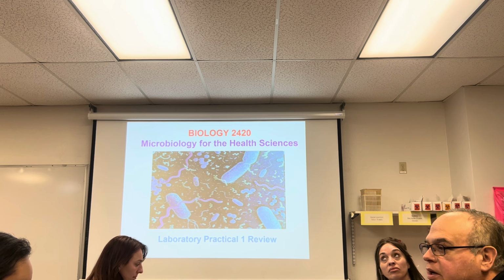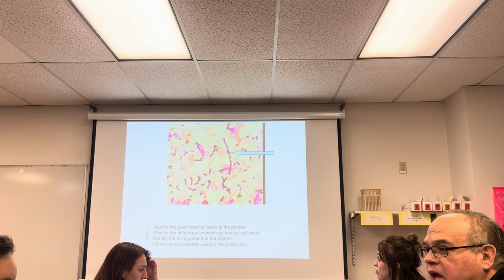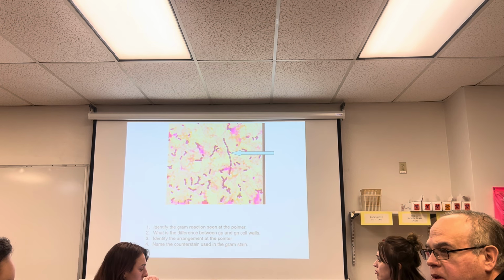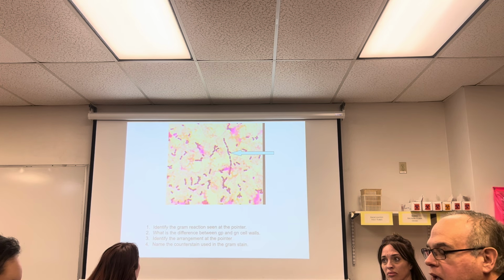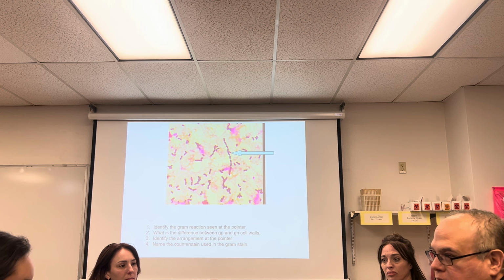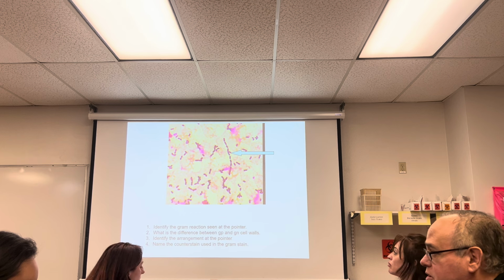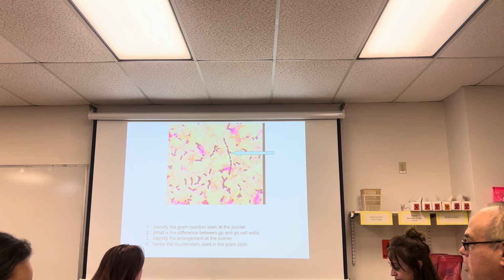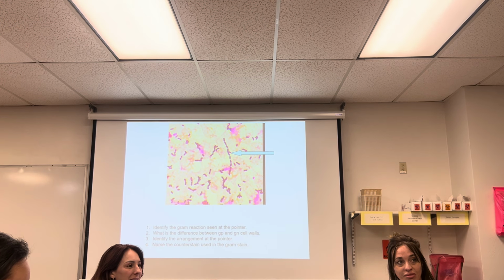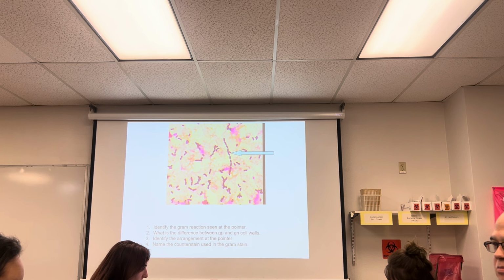So, when we look at a slide, because there's questions on here, your exam will not have questions on them. I'm just going to pop up an image and ask you what comes to my mind. That way, no practical is the same. Okay? So the first thing I want you to consider is, if you see red and purple, what do you think? Gram stain. If you see red or purple, you think gram stain immediately, unless I tell you differently.